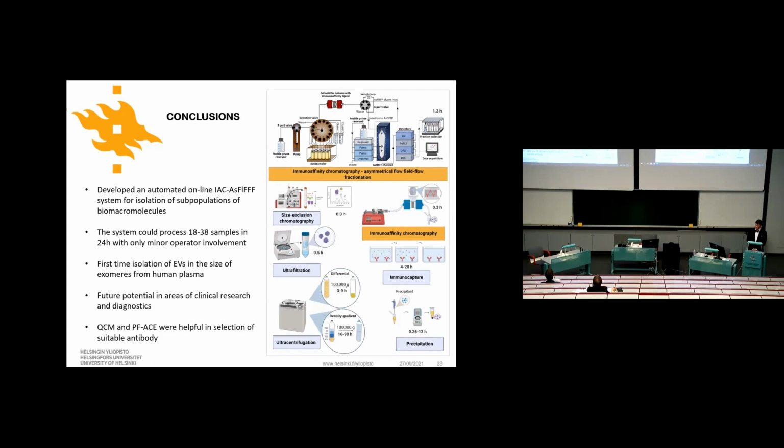This has implications and future potential in areas of clinical research and diagnostics, and maybe even therapeutics. In addition, we found QCM and partial filling affinity capillary electrophoresis very helpful in selecting antibodies and studying antibody interactions.